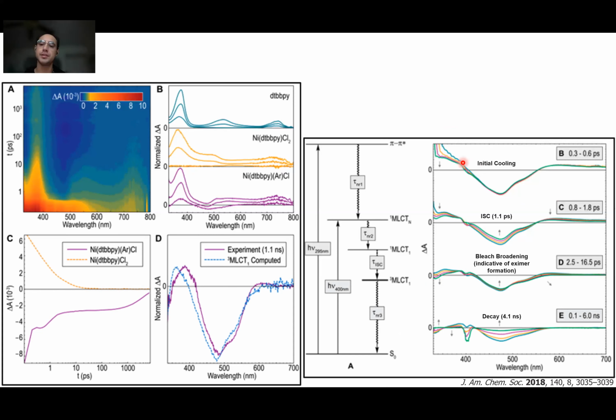And now we get to see some of the time slices of the excited state. So this is just initial cooling, in fractions of a picosecond. We're just seeing some thermal relaxation occurring here. These were done with a pump pulse wavelength of 400 nanometers, which corresponds to the excitation to the singlet excited state.